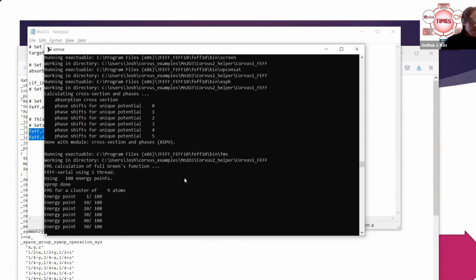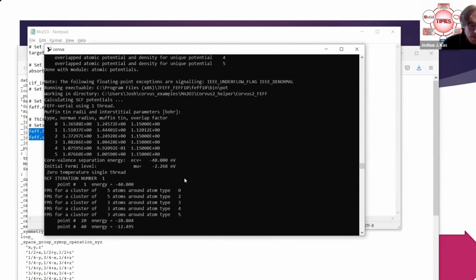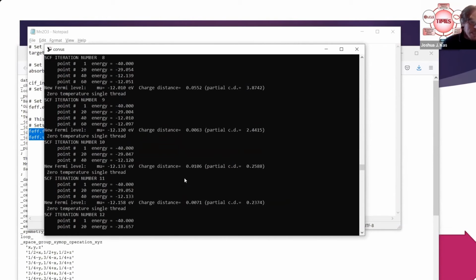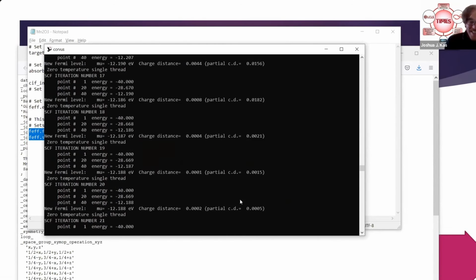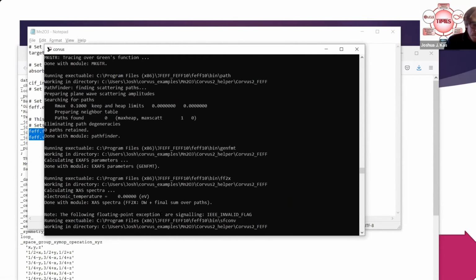This was originally written to just sum over different snapshots of like an MD kind of thing. And so it doesn't have any weightings at the moment. Although I've already fixed it, I just haven't put that in a new release. But this will show you at least the utility of this thing. So it just averages them instead of doing a weighted average at the moment. Okay, so it's done.